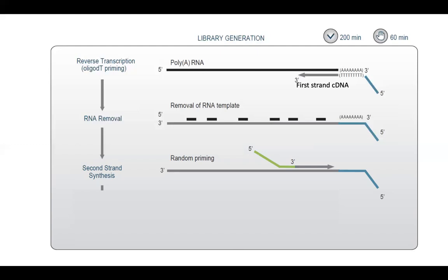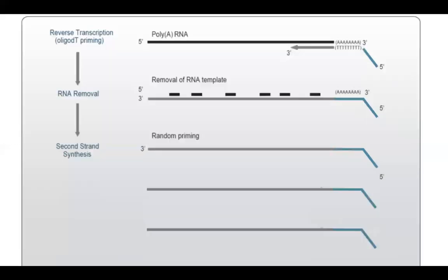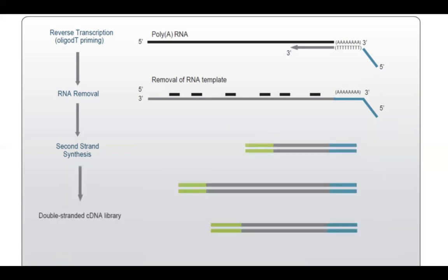So of course you have to take into account that if you have multiple transcripts from the same gene, every time a different random primer will bind, and this will lead to different fragments, so that you get different sizes of your double-stranded DNA. So even though they all come from the same gene, you can still get different fragments, right?